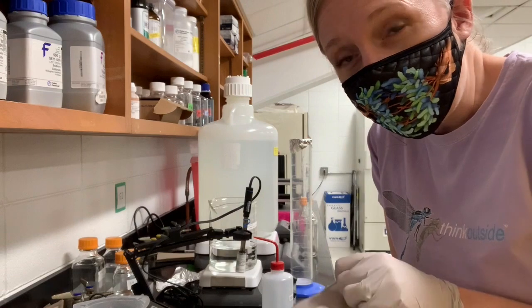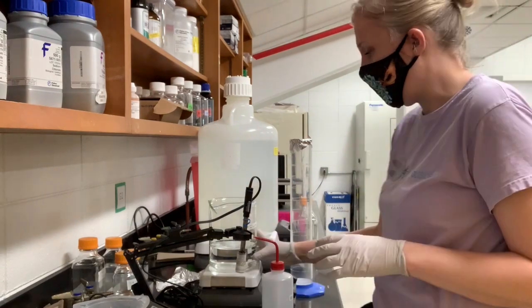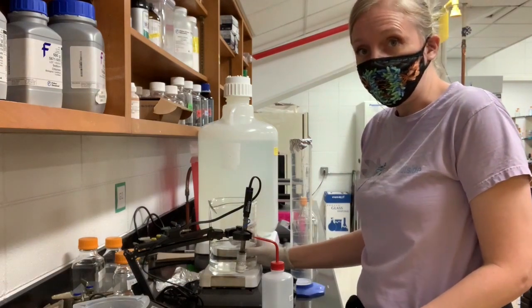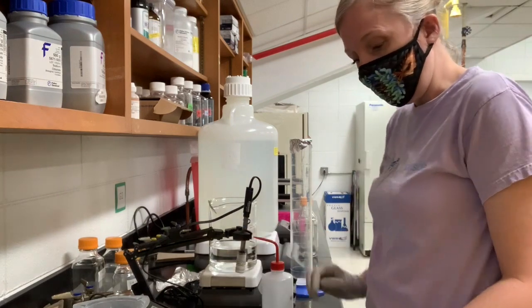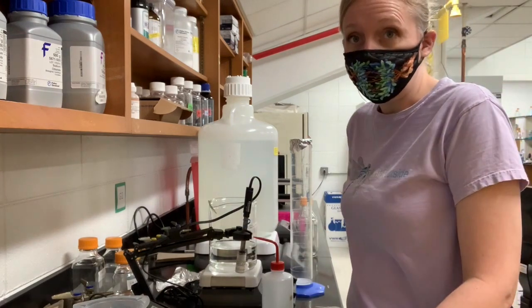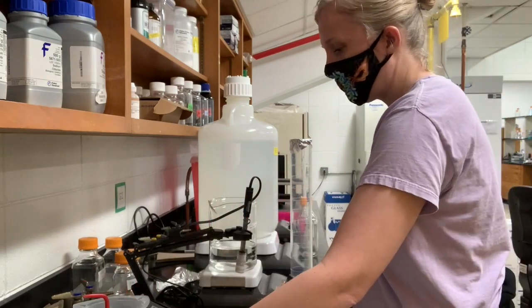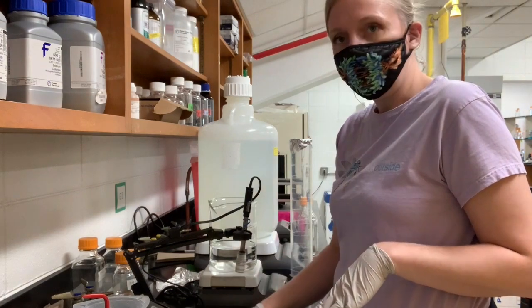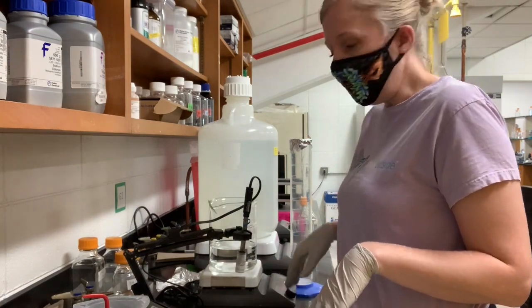Okay, so I've watched the salts in my solution dissolve, and I now have this 10x PBS solution that's gone all the way into solution. And the next thing we need to do is we're instructed to pH this to 7.4. And so we have a pH machine here. It's a black machine that's between the scale and the first stir plate.